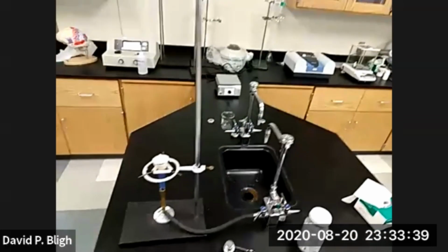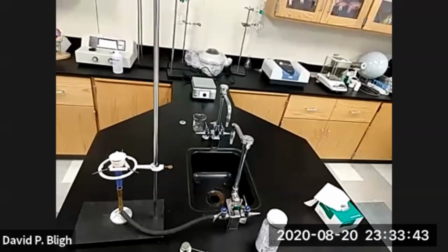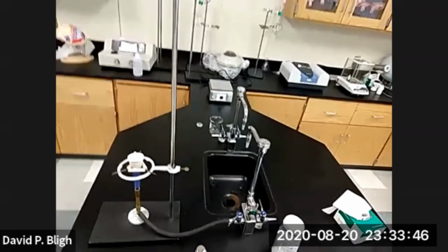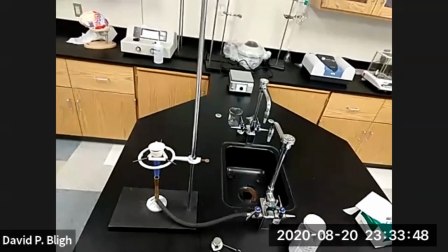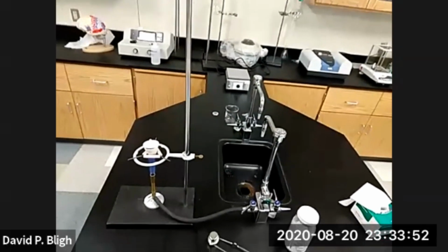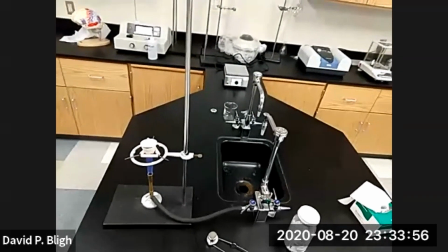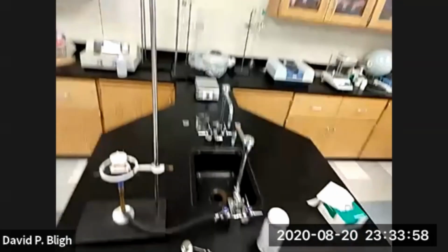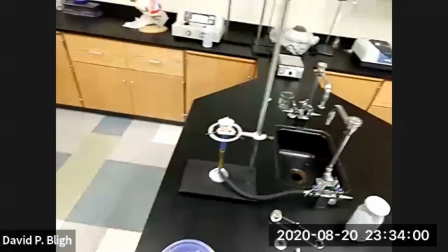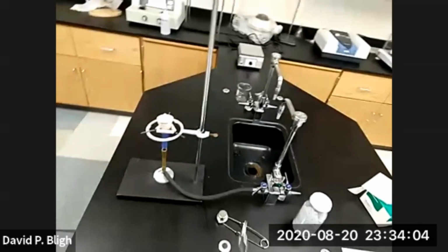In addition, we use tongs because the difference in weight is so small. If you touch these things with your hand, even if they're cold, you have added weight by your fingerprints. The oils on your hand will bias the weight over what the actual weight is. So we want to handle things either with gloves if they're cold or with tongs if they're hot.